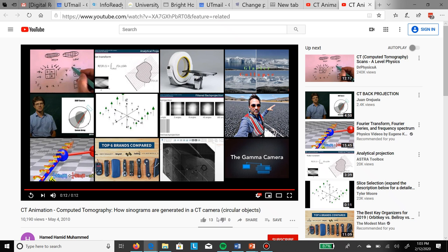And why you didn't see that in the demonstration yesterday is that most of it was sandstones. At this projection level, it was all kind of homogeneous, even though sandstone is a mixture of voids and solids, where solids are highly attenuating and voids are not at all. Yes. So that's this. What is the level of resolution that you have to see the details?